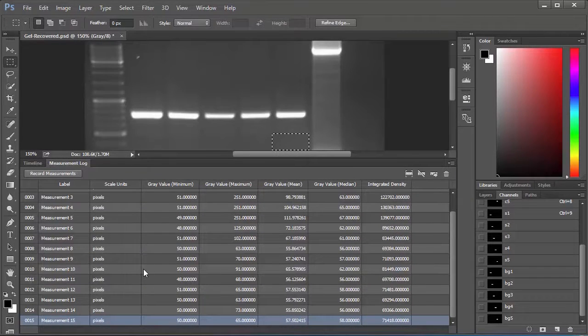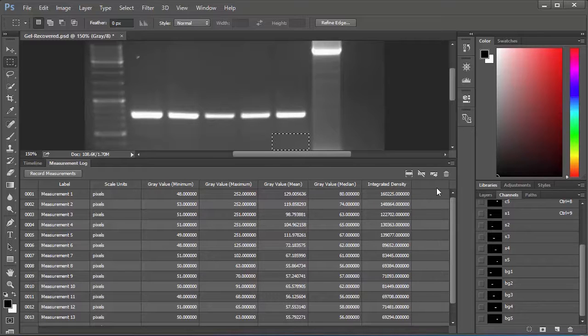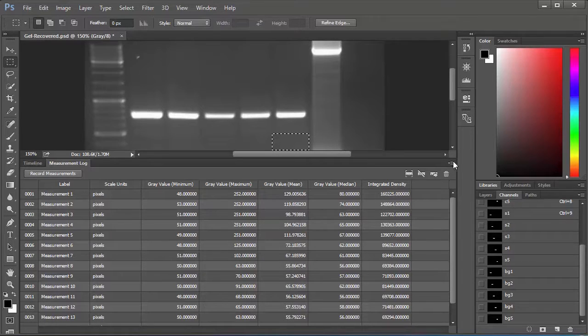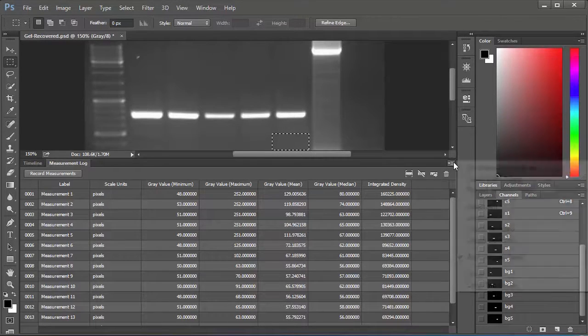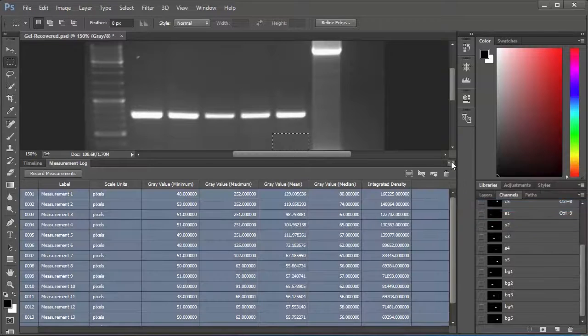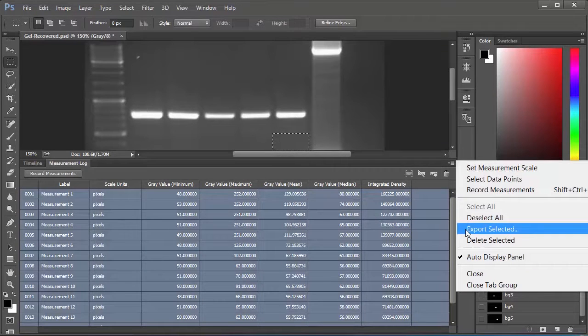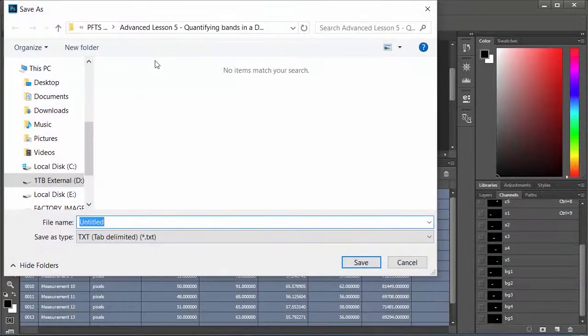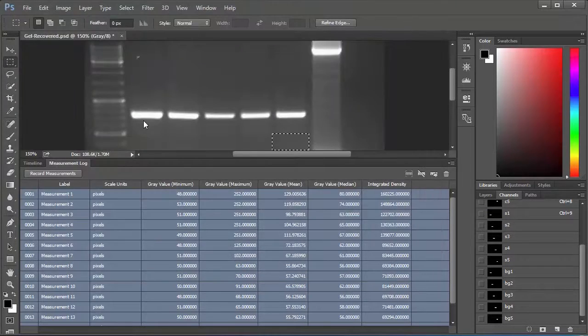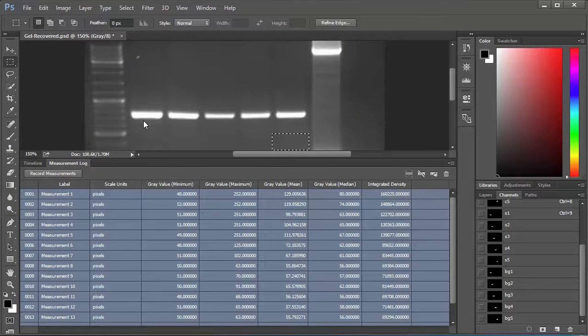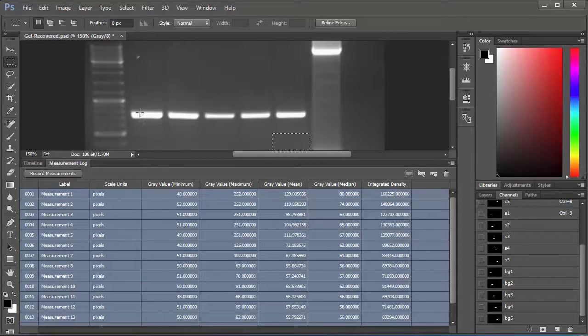You can't really do much more in Photoshop, but what we want to do is export this data into anywhere really. It exports into a text file which we can import into Excel. To do that you click the little menu again here and you'll say Select All, and then you'll say Export Selected. You can call it whatever you like, I'm going to say measurements and hit Enter. I'm going to load this into Excel if you just give me a second here.